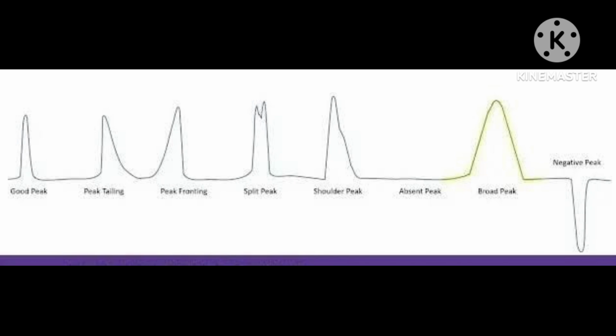Some system issues also cause negative peaks, like back pressure and detector problems. Back pressure. Changes in HPLC system back pressure, such as from an injection valve actuation or an air bubble, can cause negative peaks. Detector problems. There might be an issue with the detector itself, such as a problem with the polarity or physical connection determining the polarity of the detector signal, which causes negative peaks.